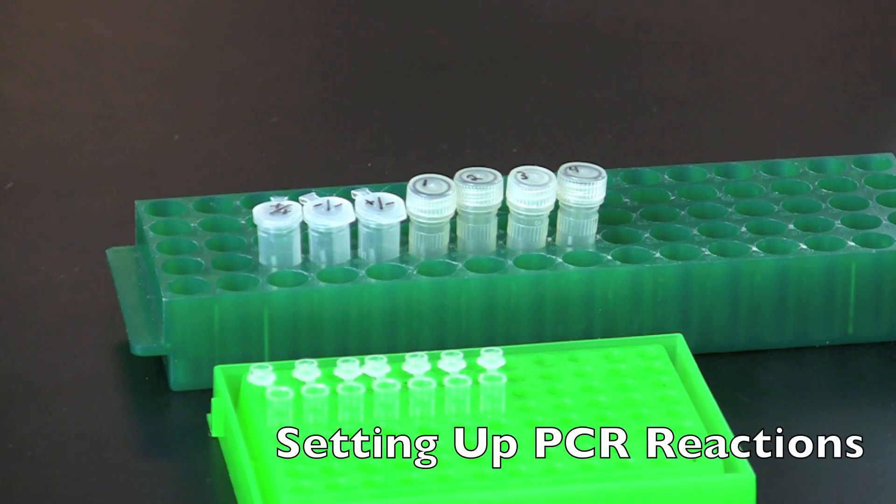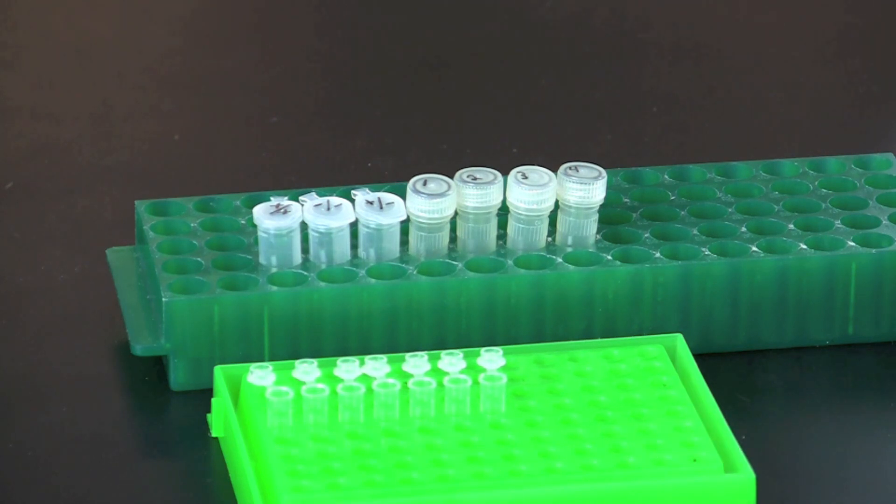If working in groups, each person in the group should prepare one PCR reaction using the following procedure. Each lab group should have a rack with the following samples.